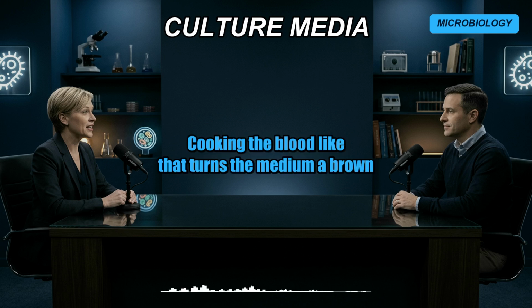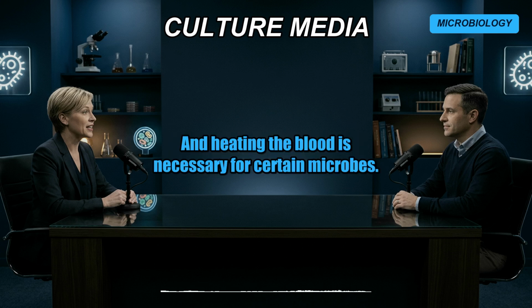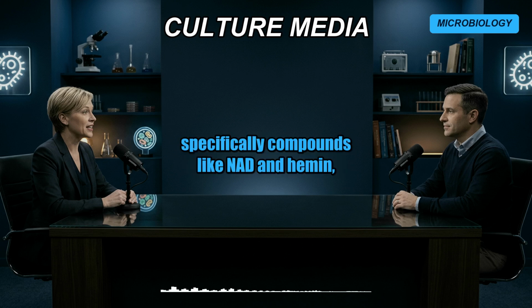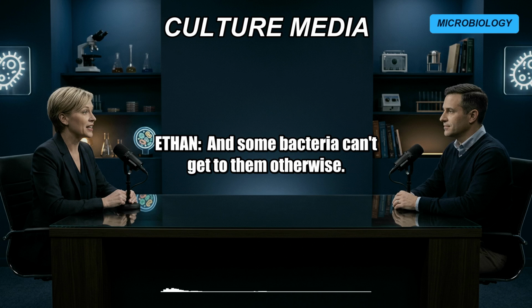Cooking the blood like that turns the medium a brown chocolatey color. So it's basically just cooked blood. That is exactly what it is. And heating the blood is necessary for certain microbes. It releases intracellular nutrients, specifically compounds like NAD and hemin, that are securely locked inside intact red blood cells. And some bacteria can't get to them otherwise.